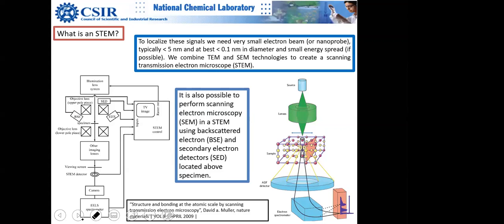Thank you. So now I told you so many things, but now you will be asking who detects it actually. So there are detectors. You can see that there are different detectors. This is basically the illumination system, the prime illumination lens system. The electron beam comes here, and then you have different detectors. This cross is basically the magnetic field. These are magnets.